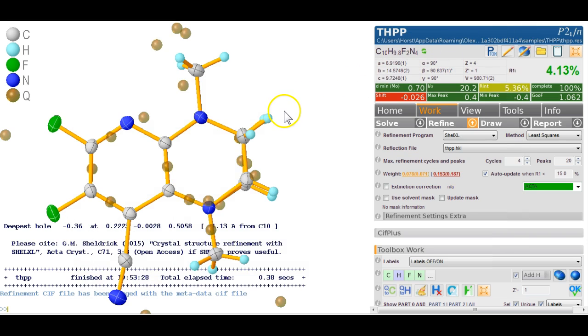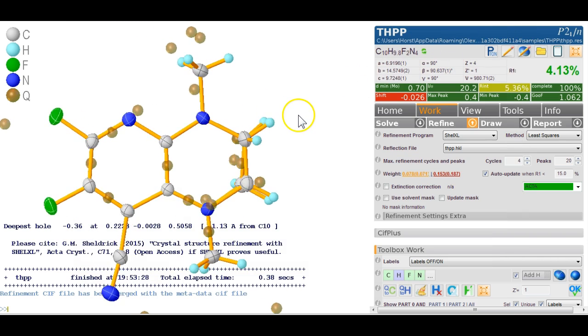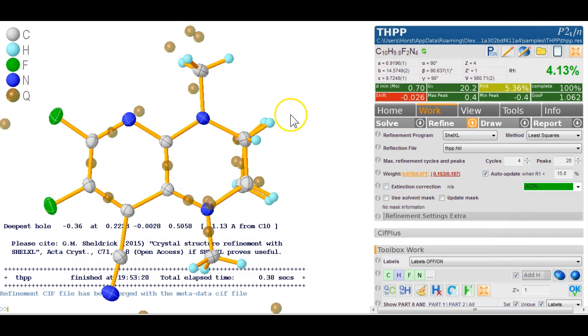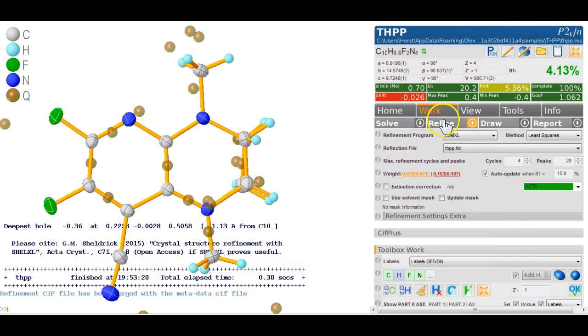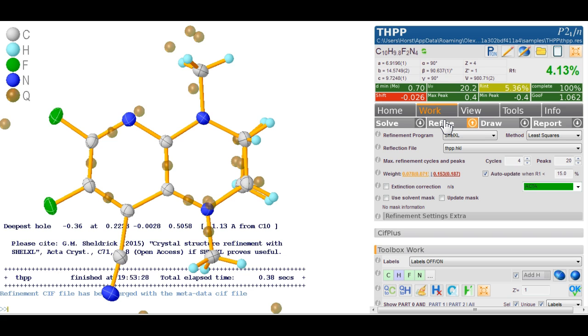Okay so I said this all happens in the background and if I hit refine it refines. But you might ask where's my INS file? Well if you're new to this field you probably won't ask that question because why would you know about an INS file and really there is no reason if you use Olex 2 why you would need to know about an INS file.